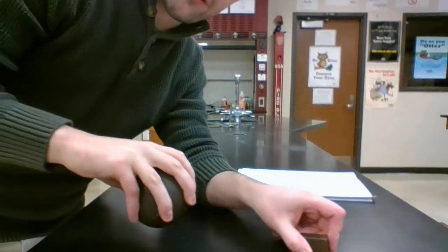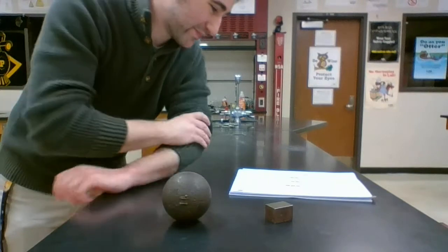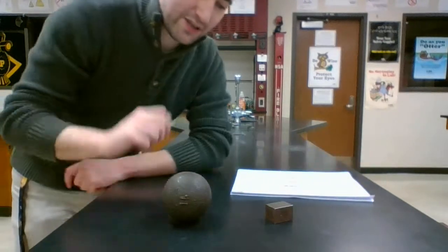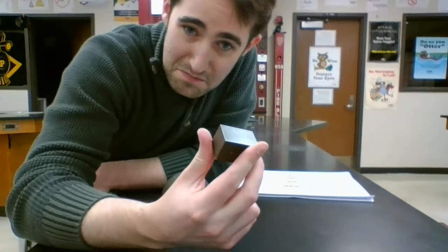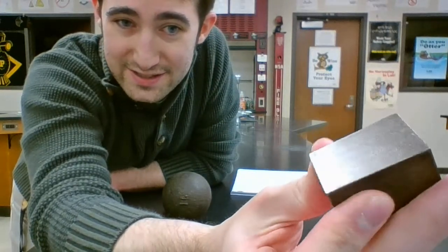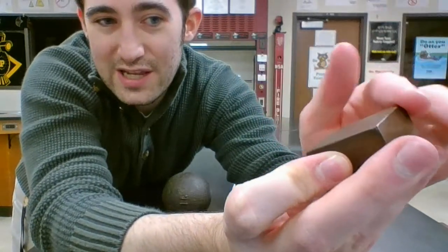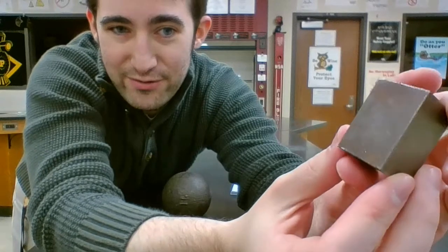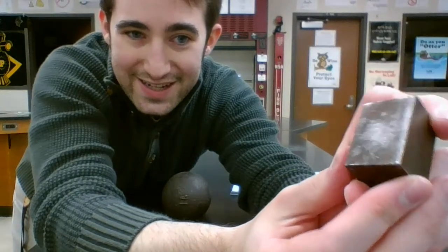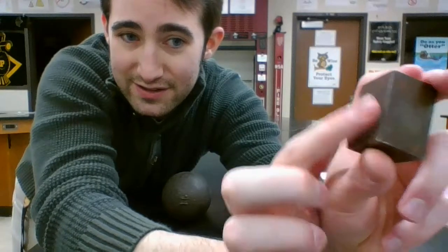I have a rusty iron block and a rusty iron sphere. Now this was originally just iron. And if you look closely, I've kind of scrubbed off and polished this side so you can see the sheen. It's nice and smooth. But if you look at the other sides, if you've ever felt a rusty surface, it's kind of uncomfortable. It's kind of dull. It's got a reddish brown color, and I can feel it's rough.